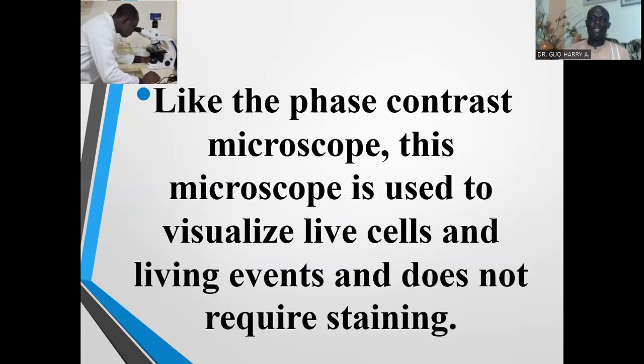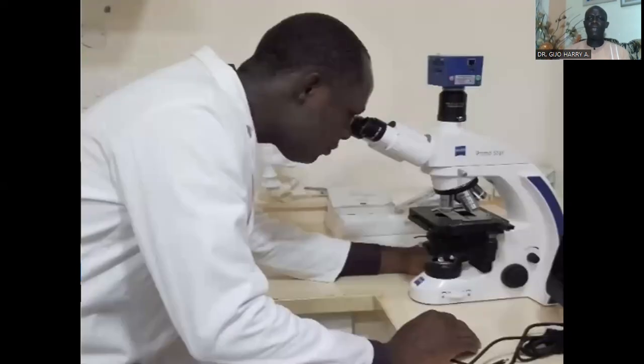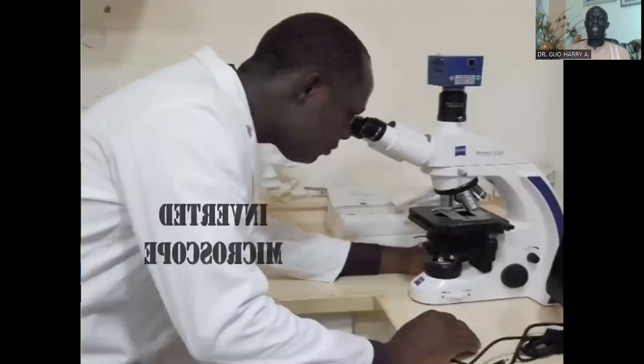This microscope is used to visualize live cells and living events and does not require staining.